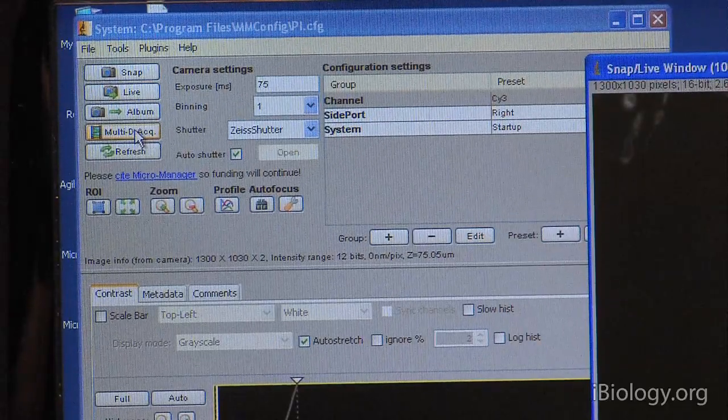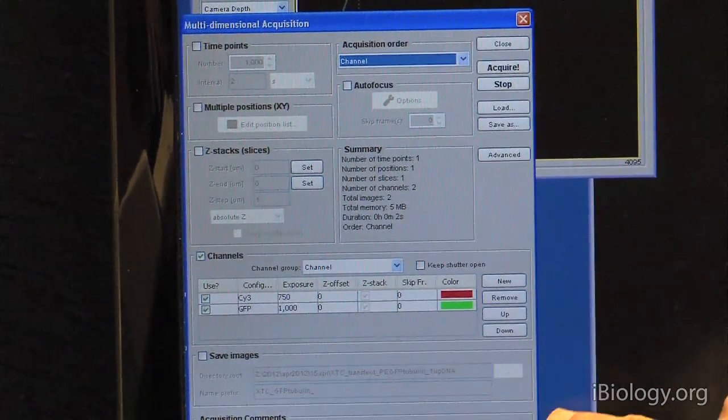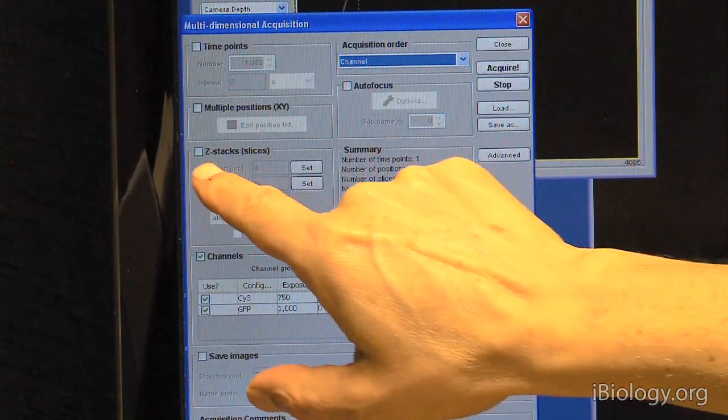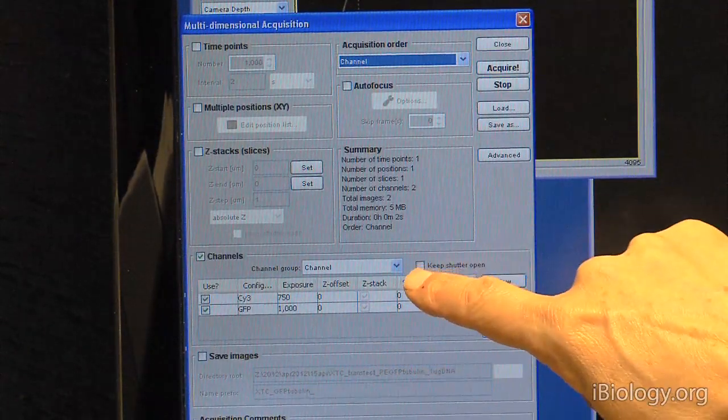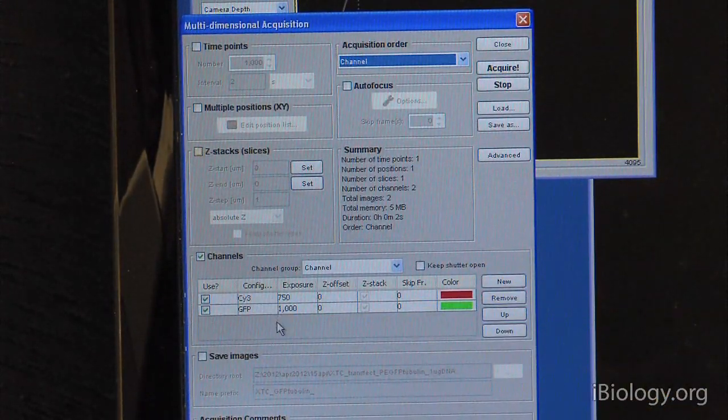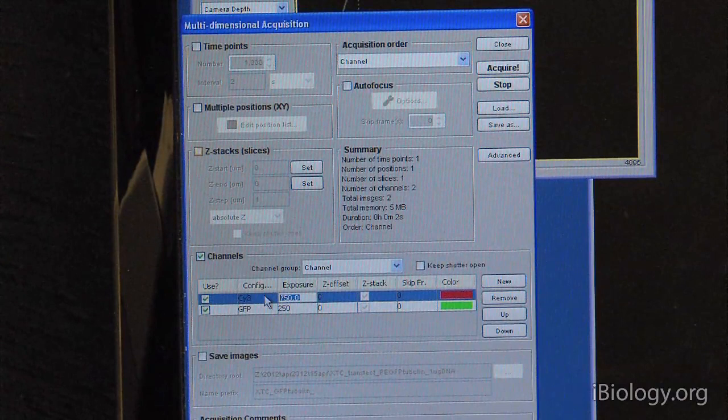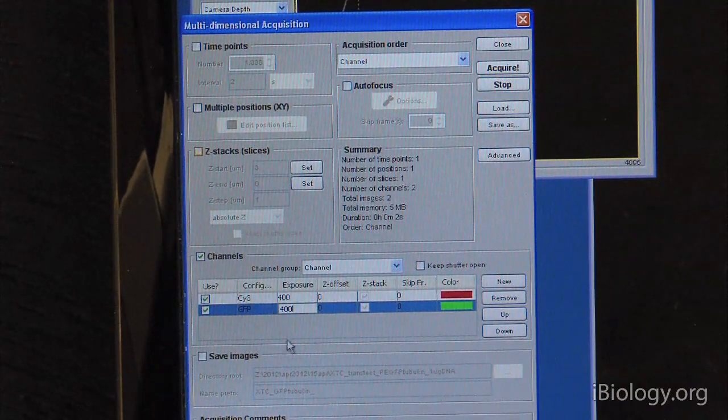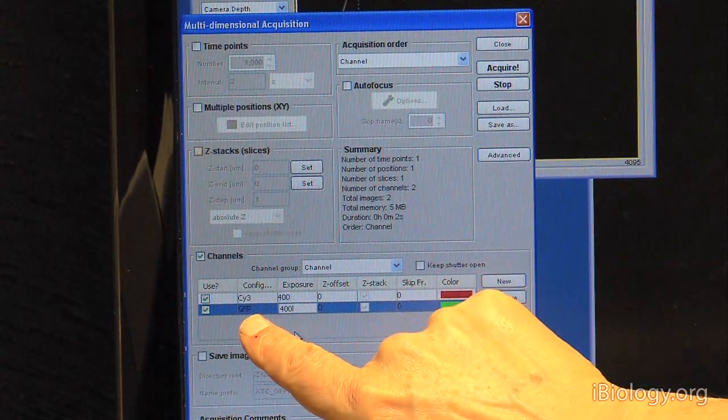You will often want to set up experiments where you take these two different channels and do things as time lapses or take Z-Stacks. That is all hidden under this Multi-D acquisition button. When I press that, we get a new window. And in this window, we can set up time points. We can set up multiple XY positions. We can set up Z-Stacks. And we can set up channels. Now, these channels we get from that same group that we just used, the Cy3, that has Cy3 and GFP in it. So, I'll set the exposure time for this particular channel. Probably something like 400 is good enough. In this case, we're only using channels. We're taking one image with the Cy3 dichroic and one image with the GFP dichroic.